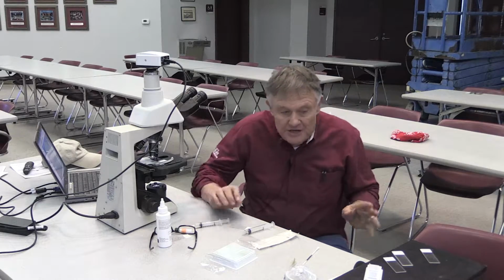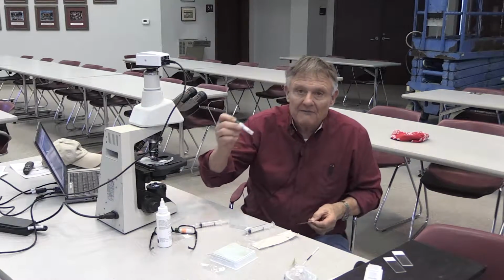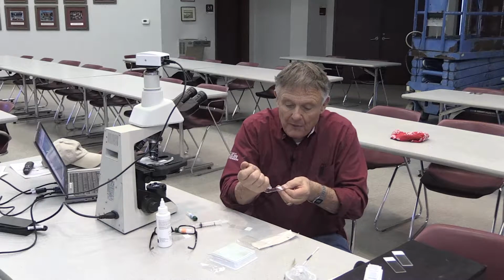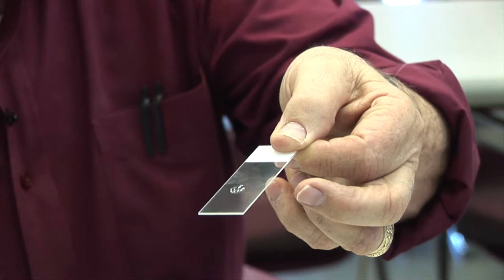Again, as we do the motility, this is a little bit of phosphate buffered saline. So generally what I've done is put a little in this syringe. I want to put about a drop on that slide.